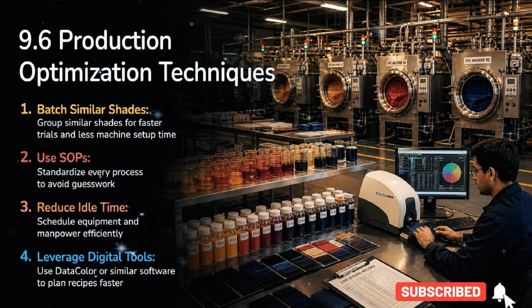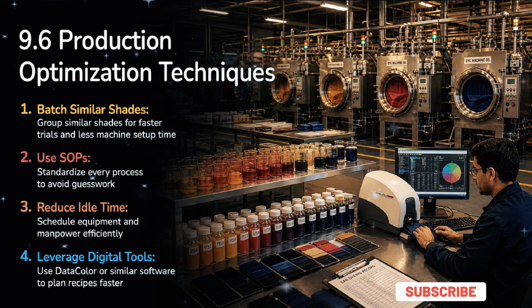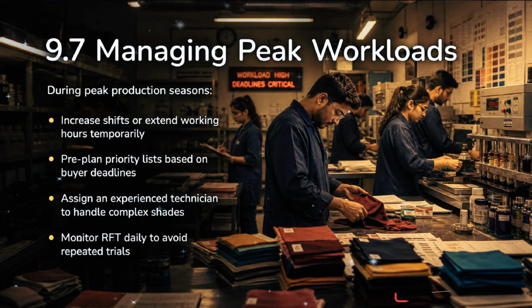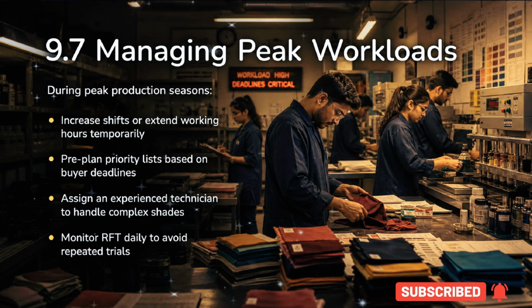Boost production by grouping similar shades, standardizing processes with SOPs, minimizing idle time for equipment and staff, and leveraging digital tools to accelerate recipe development. When facing peak workloads, maintain efficiency by adjusting shift hours, strictly prioritizing tasks based on deadlines, assigning expert staff to complex shades, and monitoring right first-time results daily.